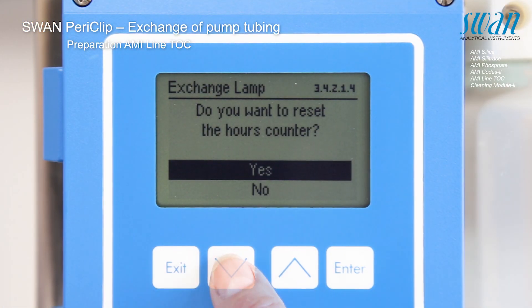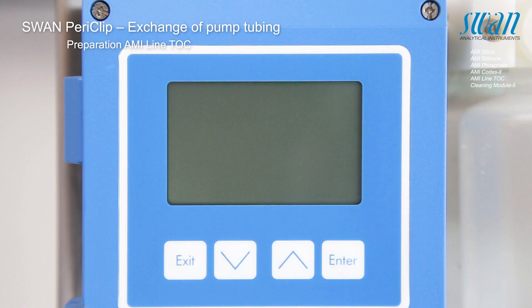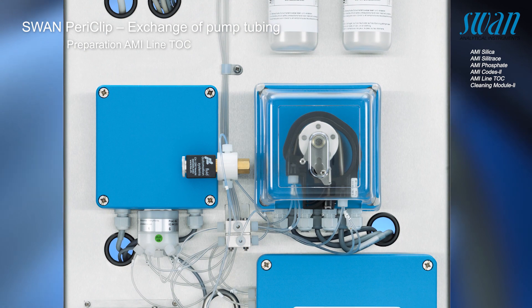If only the tubing will be changed, the answer is no. After the instrument has been switched off, it is ready to have the periclip tubing exchanged. Take care.